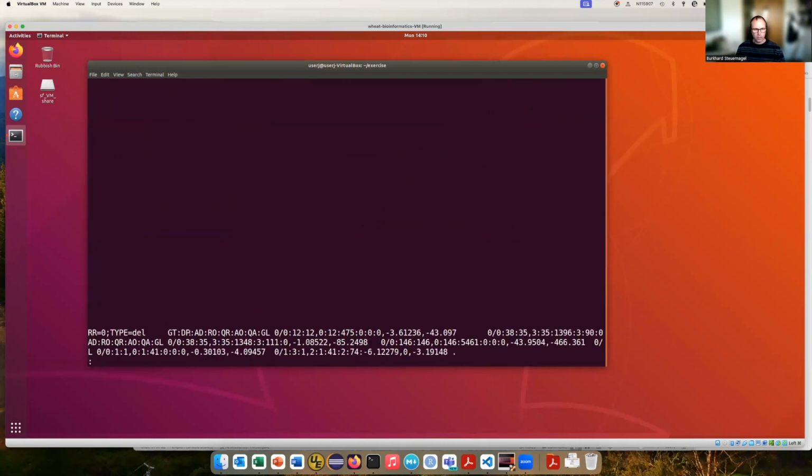here we would see GT, DP, AD, and so these are all the fields. This is our format column, and then this is followed by 3 additional columns, which are the 3 samples that we entered. If you consider this VCF file, this GT field is the one that is most commonly present whenever you do SNP calling.